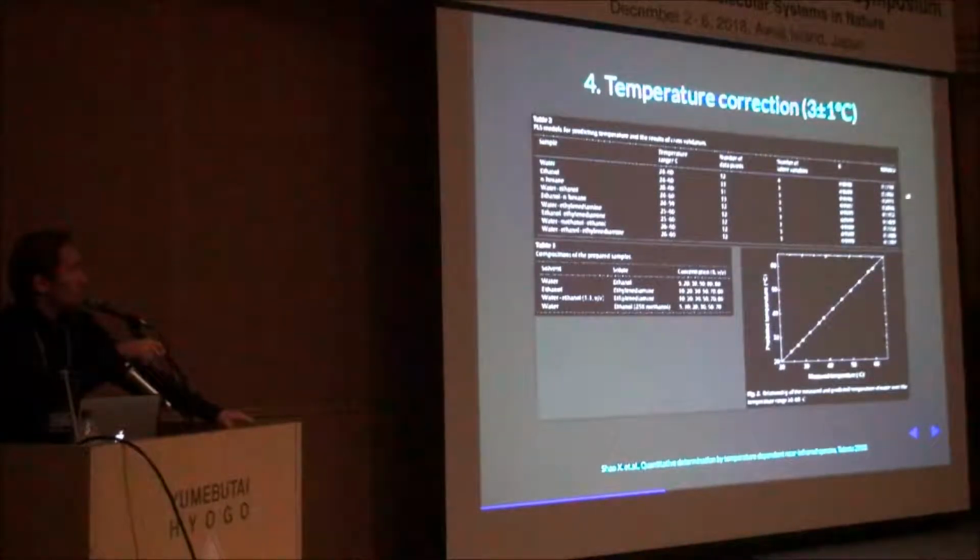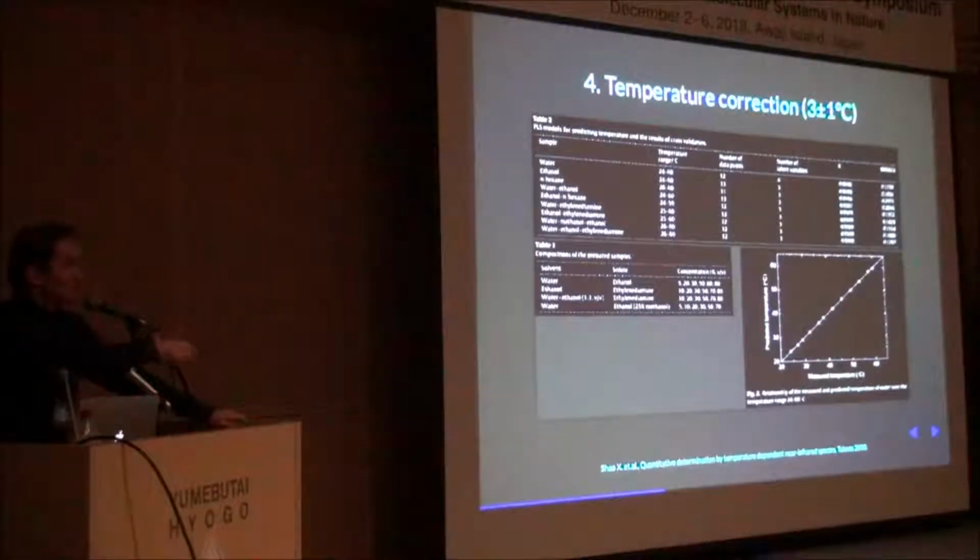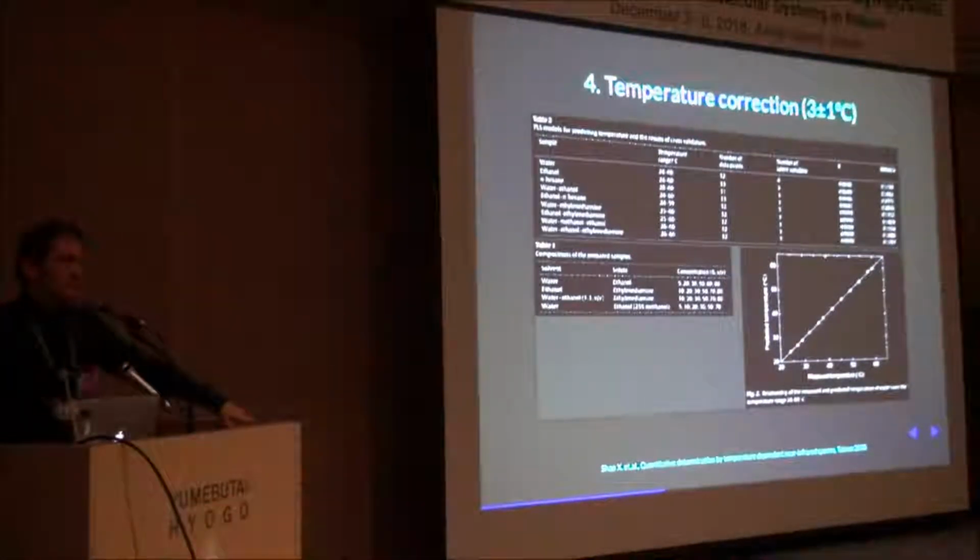And the errors that they're reporting in predicting the temperature of the sample, which is what the paper is all about, is a cross-validated error of 0.1, which, okay, I'm going to leave to you. And the calibration curve looks perfect. Where is that column? Yeah, it's here. The R squareds are 0.999 something.